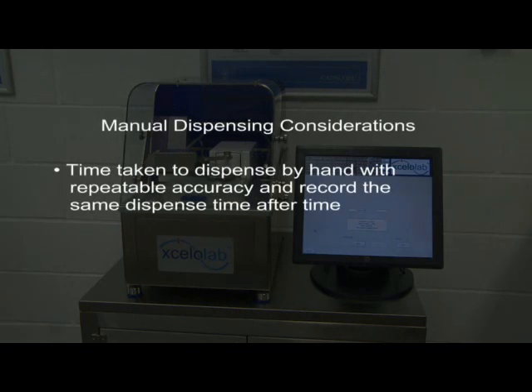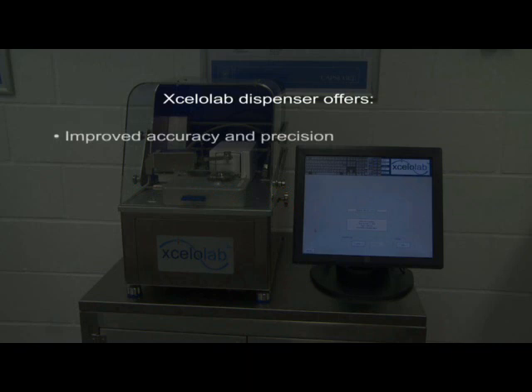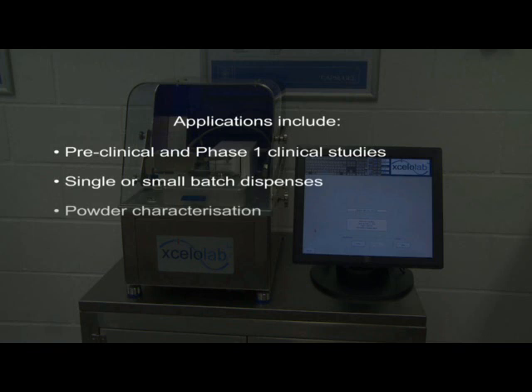Consider the time taken to fill powder by hand and record the same dispense time after time. It's likely that there is a considerable margin for error, as it's difficult to dispense by hand with repeatable accuracy. In a solubility screening trial, 20 vials were successfully filled with 5 excipients at weights varying from 21.88mg to 175mg in 25 minutes. By hand, this would have taken 2 hours. The Xcelolab dispenser is suitable for any laboratory with the need to dispense powders and is applicable to a variety of applications.